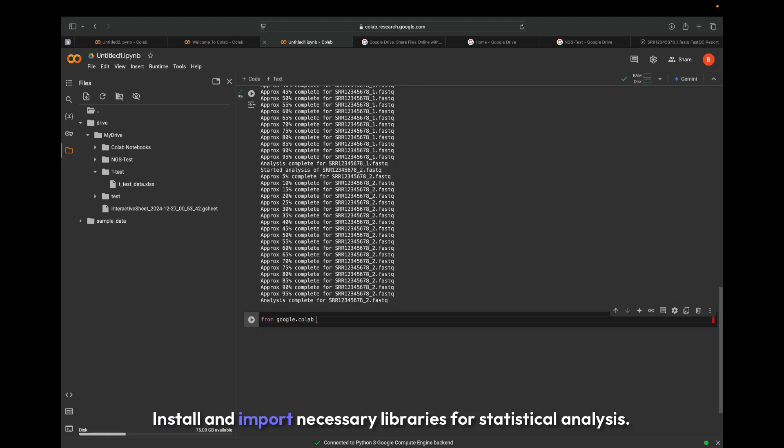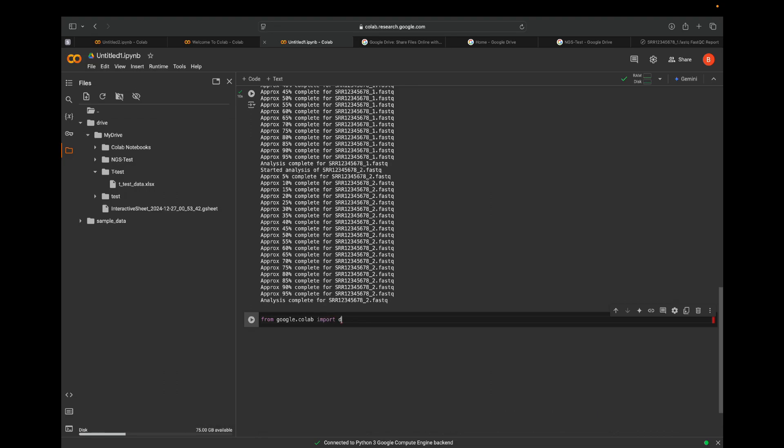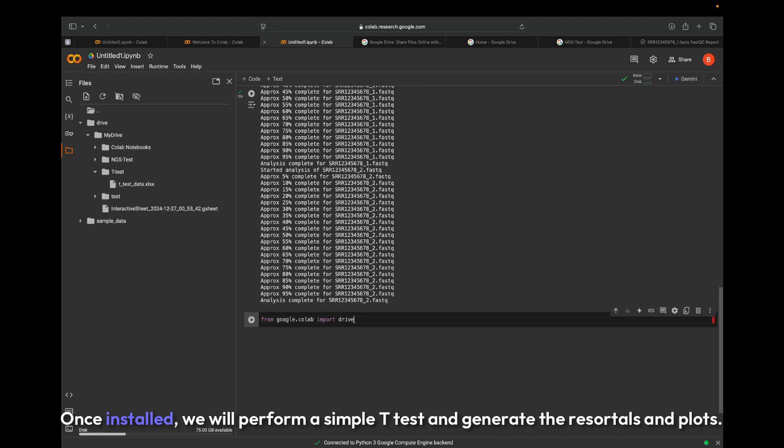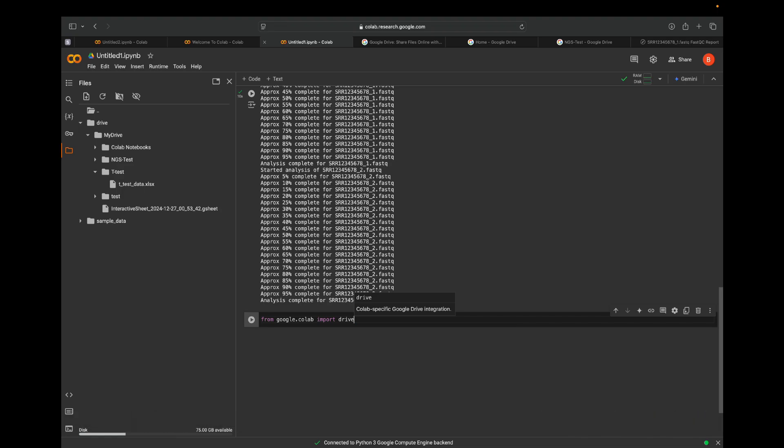Install and import necessary libraries for statistical analysis. Once installed, we will perform a simple t-test and generate the results and plots.